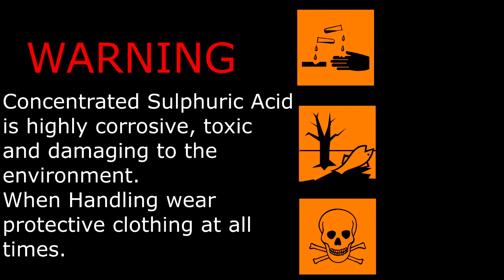Warning: concentrated sulfuric acid is highly corrosive, toxic and damaging to the environment. When handling, wear protective clothing at all times.